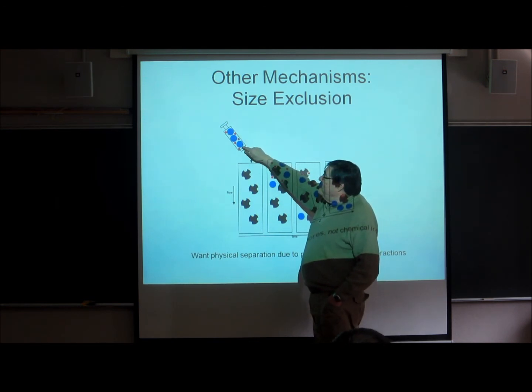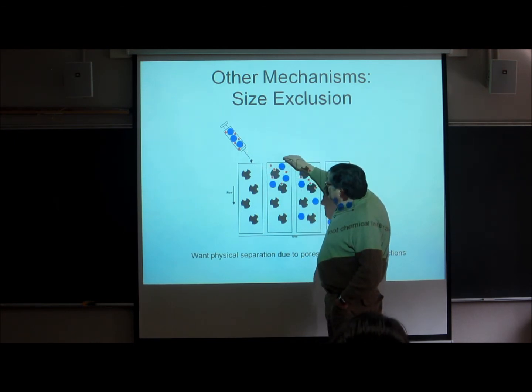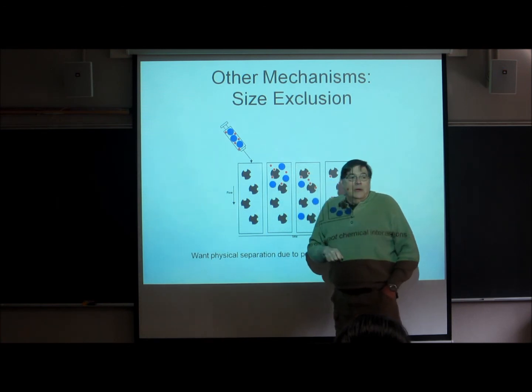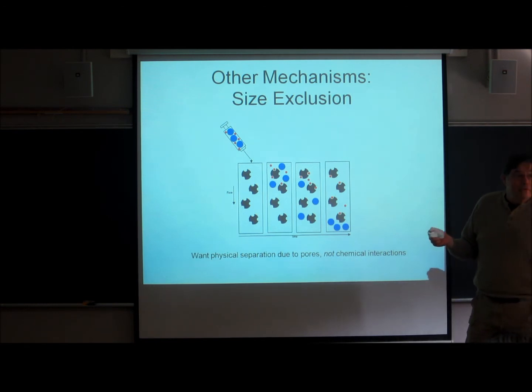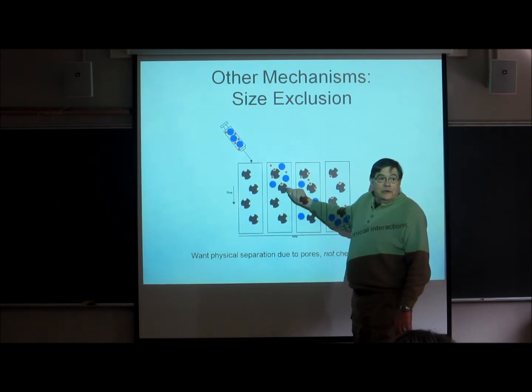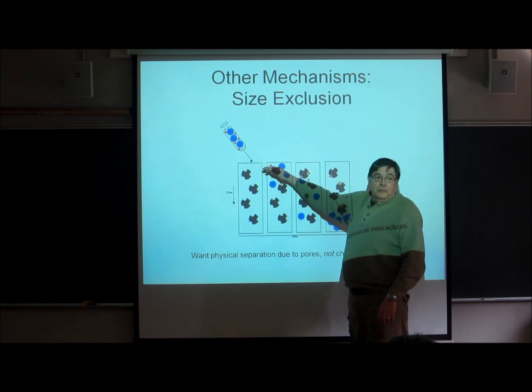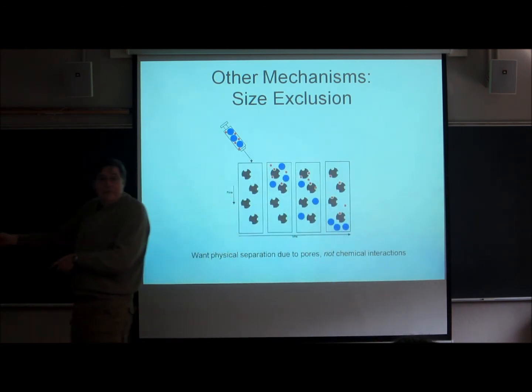proteins of different sizes, and they come in and separate out. All the particles try to get into, the proteins try to get into the particle as best they can by diffusion, right? They go from where they are to where there aren't so many of them. They're loners. And what we find is that the little proteins can dig down into the pores much more deeply than the big proteins. And after the whole mess of proteins goes by and the concentration up higher in the column declines, diffusion outward occurs, right?